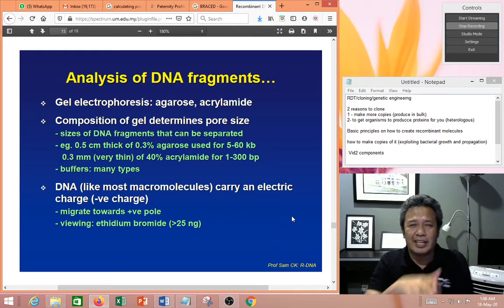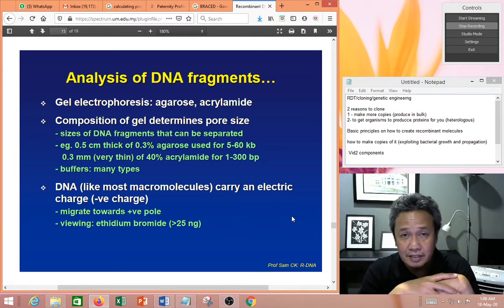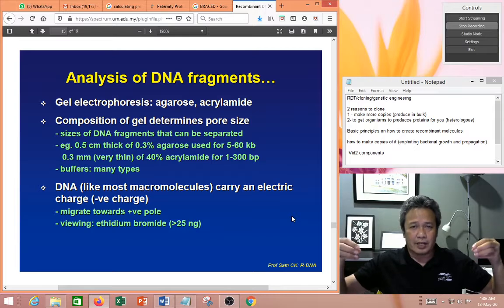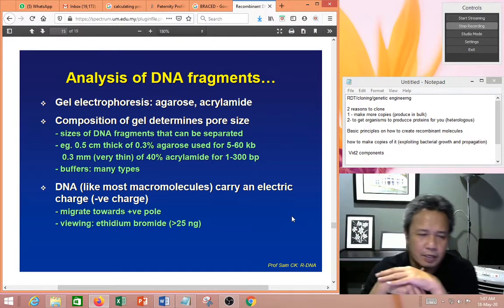How do you move your DNA? You apply an electric current. DNA is negatively charged, so if you put a positive charge, your DNA will be pulled towards the positive charge.